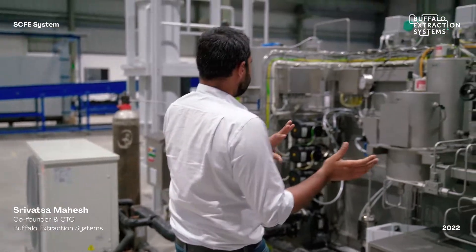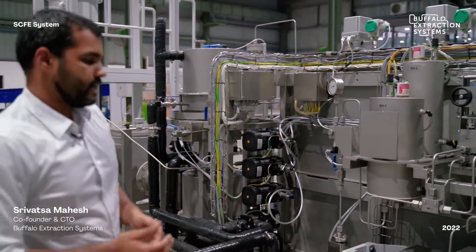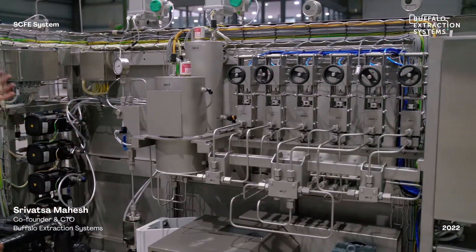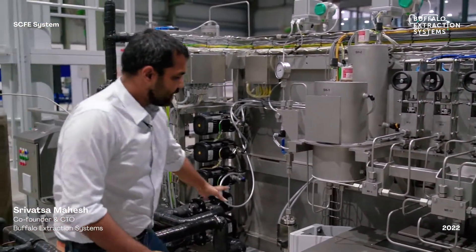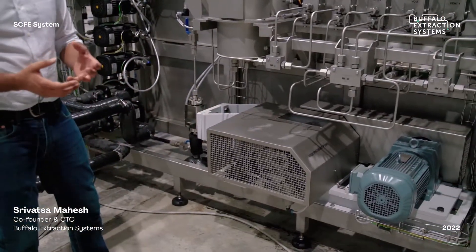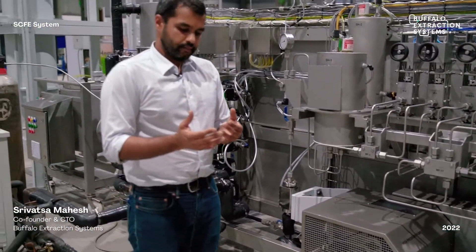This part of the plant is where the utilities are. The CO2 from the tank is chilled and enters a single plunger pump used to pressurize the CO2 from 60 bar up to 350 or 400 bar pressure. These pumps are also available up to 650 bar if your product demands it.